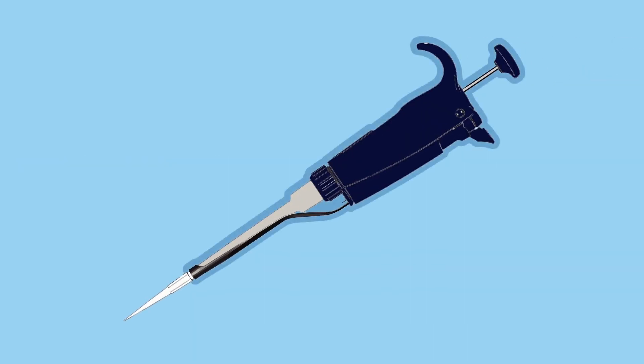Barrier, often called filter tips, serve two purposes: to protect your pipette from aerosols created when fluids are aspirated into the pipette tip, and to protect the pipette from contamination and or damage from over-pipetting.